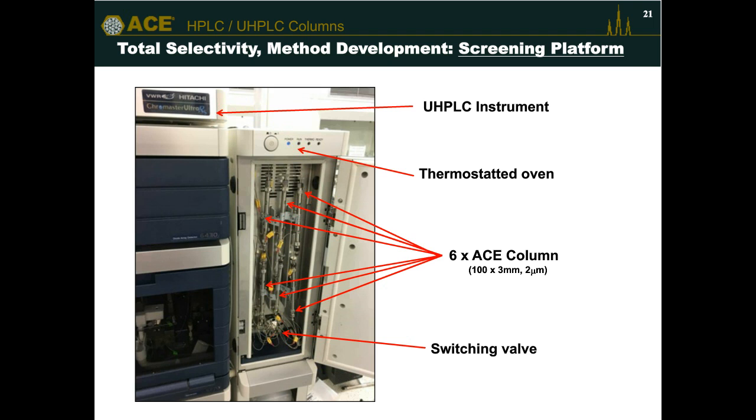Now I have a whole separate talk on method translations and how you can get a quantitative transfer of your chromatography irrespective of the column dimensions, if you use the right equations and the right tools. That's another separate talk. But yes, to answer the question, we screen on this format, we develop on this format, but then depending on what the person had asked us for, we will either give them a method in HPLC or a method by UHPLC, or sometimes they don't care and they're happy with our screening format. So it depends.